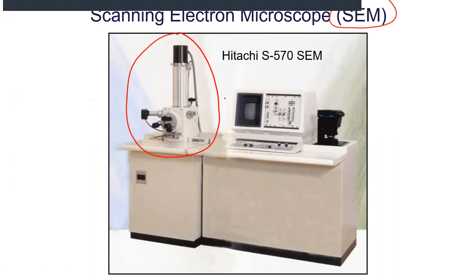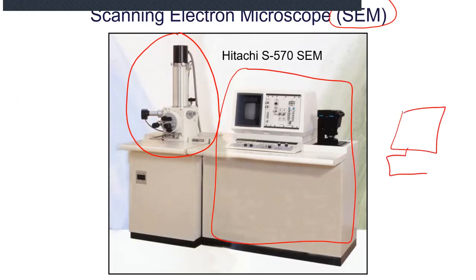And what you're looking at over here is used basically for focusing, but it used to be a bit of a computer. Somewhere over here we actually had just sort of a desktop computer, you know, sitting there and running most of the functions on it. So I'll tell you a little bit about how this thing works.